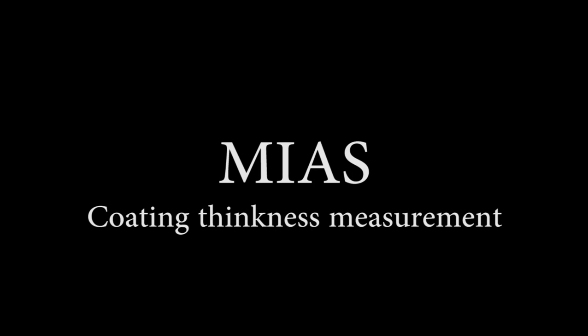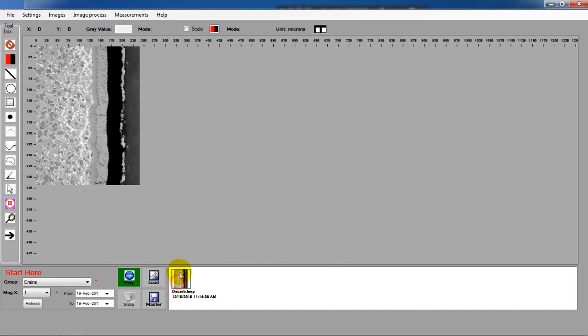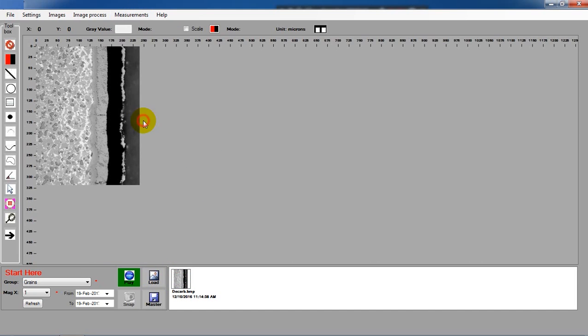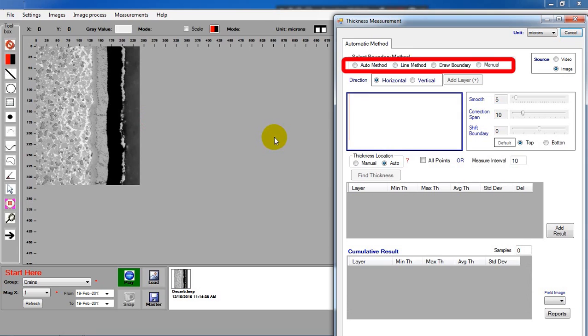This video shows you how to measure the coating system. There are four ways to define the boundary. Now choose Auto method.